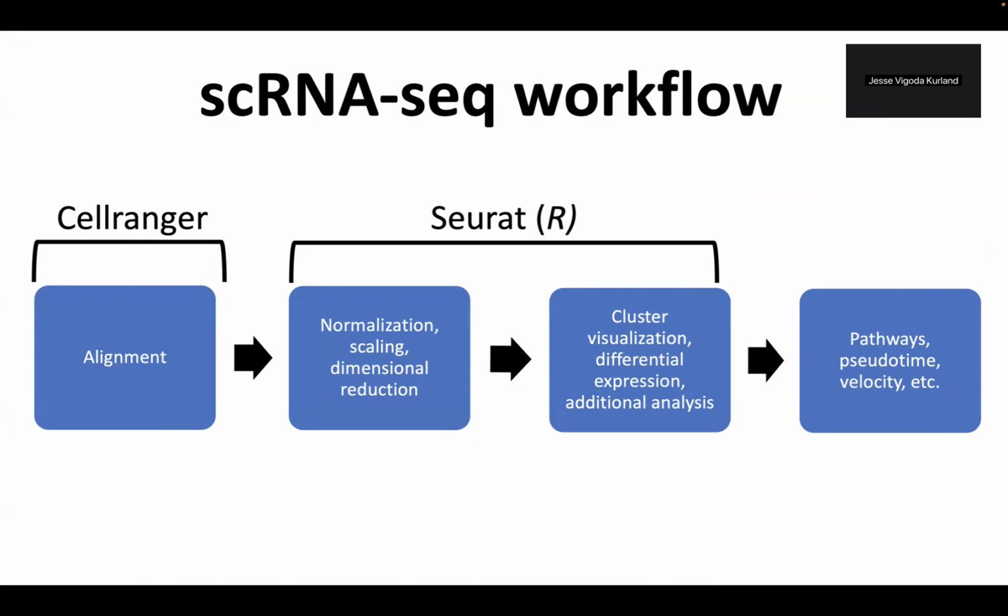Hey everybody, my name is Jesse, and I'm here to talk about single cell sequencing analysis in R, specifically using Seurat. Prior to this video and this section, you have already heard Chris talk about using Cell Ranger to process FASTQ files from a single cell sequencing experiment.